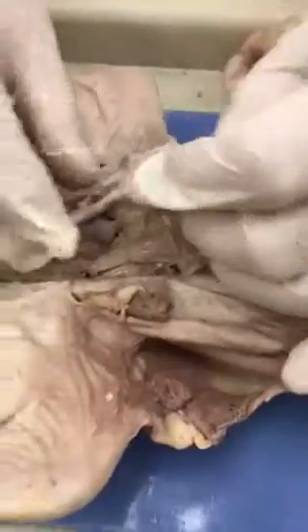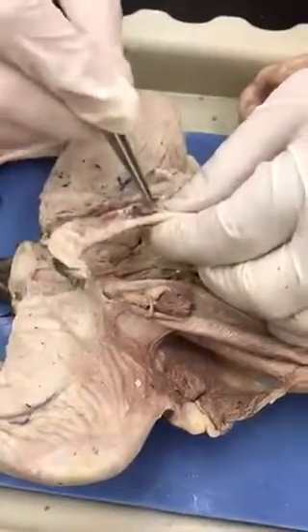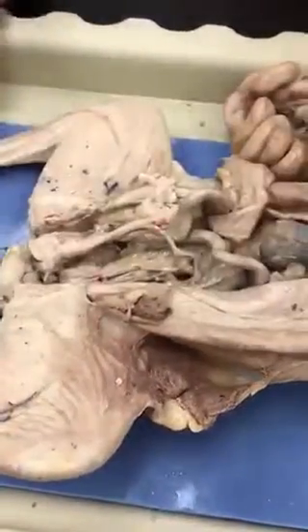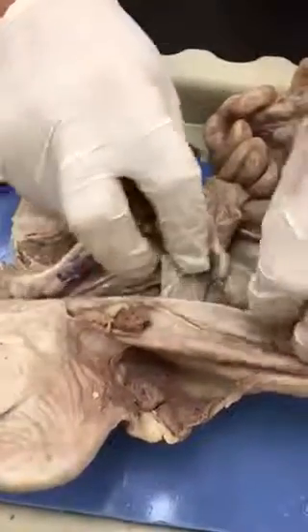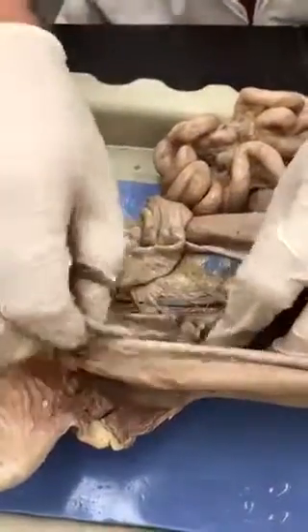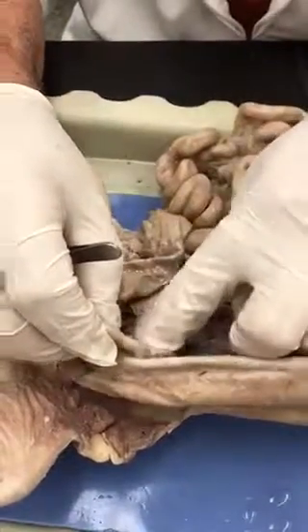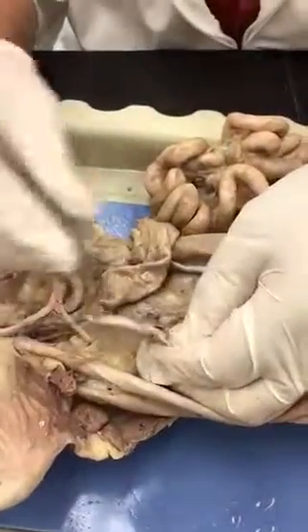Okay. So of course, when you remove the uterus, you're going to be cutting these vessels, and they will bleed a lot, so you have to tie them off. That's ligation. They get tied off. And then you also tie off these vessels here. This would be ovarian artery and vein. Remember that the ovarian artery is actually a branch of the aorta, and the vein goes directly to the caudal vena cava.